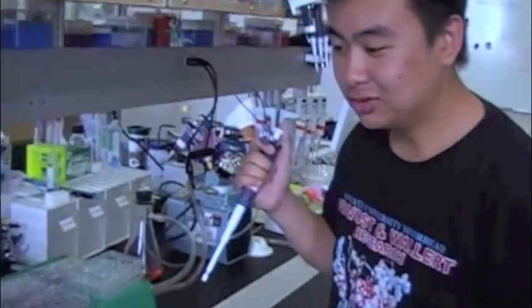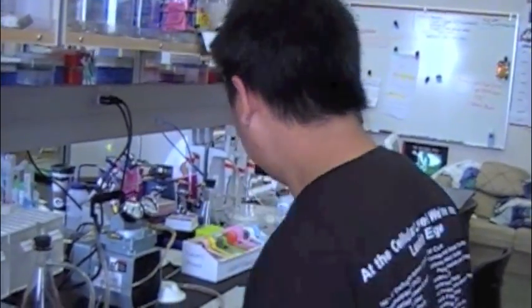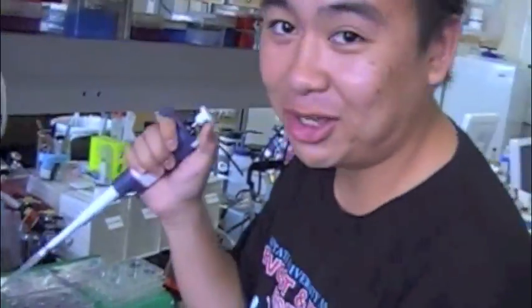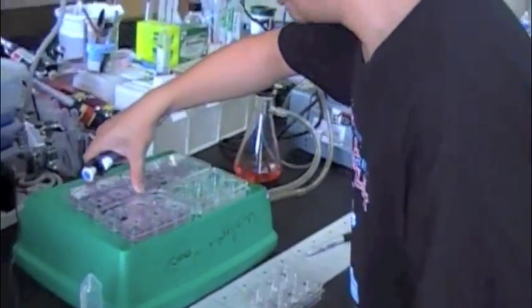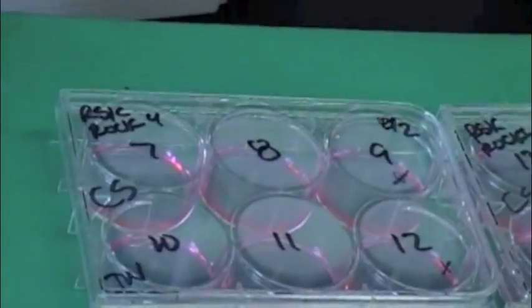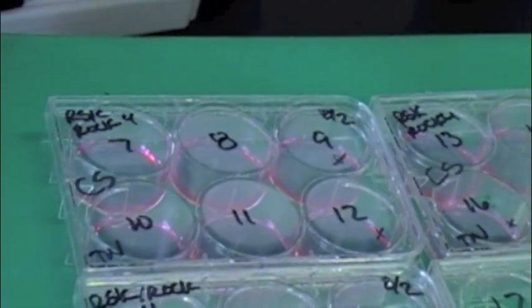First of all, we're going to use 7.4% paraformaldehyde in 1X PBS to fix our cells. The first thing we want to do is grab our P1000 pipette. The cells in the wells should be confluent enough to be fixed — around 40 to 80% confluent. They should not be over-confluent, as that changes the cell composition.